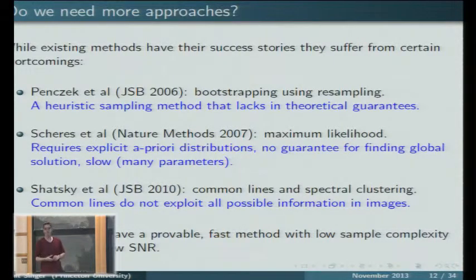resampling, the issue is that the 3D structures that you build by sampling images do not correspond to any real volume, because we sampled from different conformations, and then the reconstruction that you have is not some linear combination of different volumes.